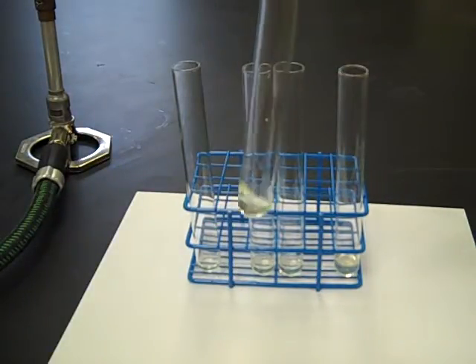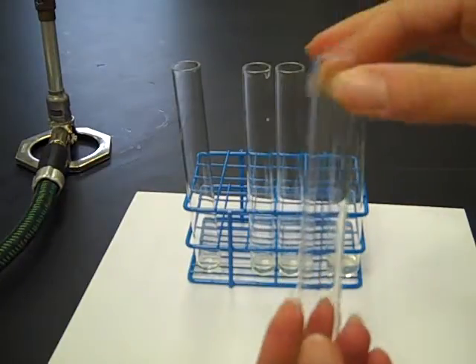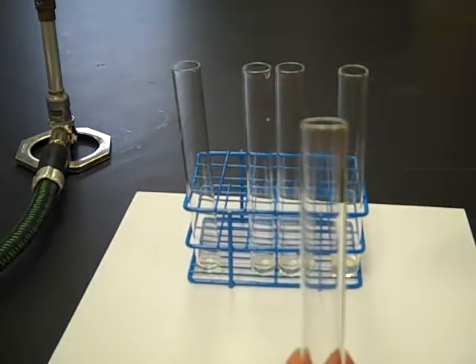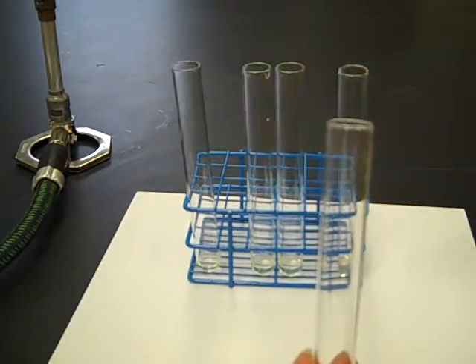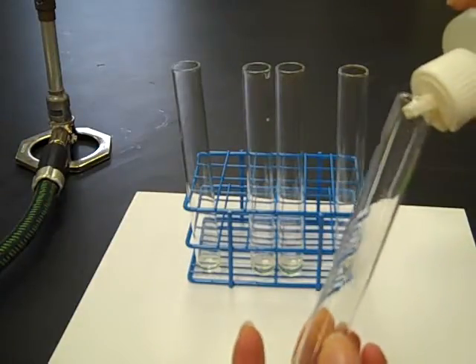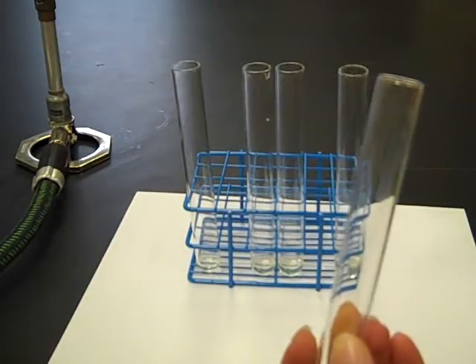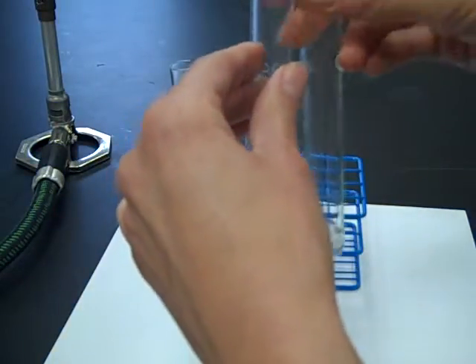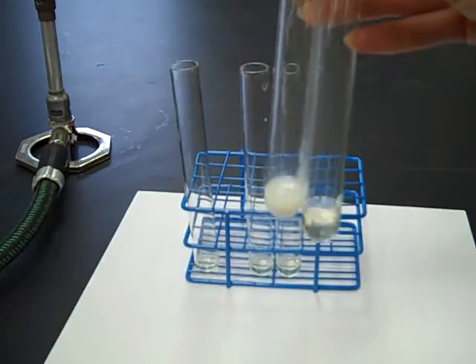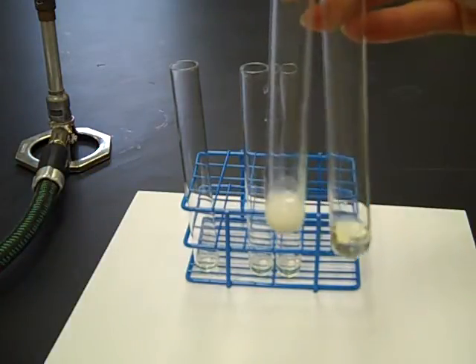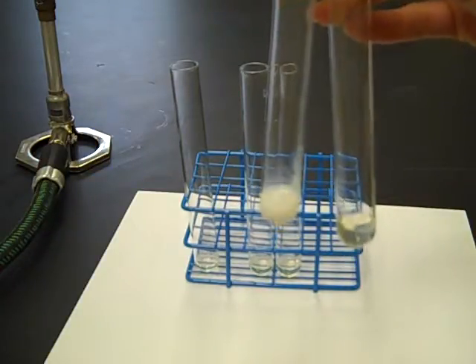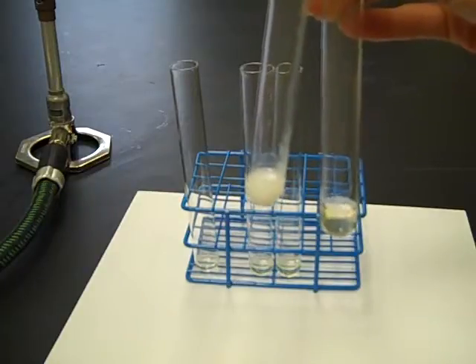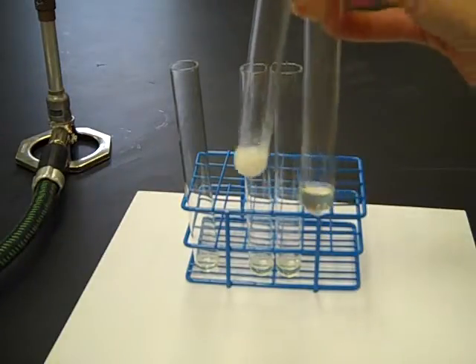To this test tube, we're going to add nitric acid. Okay, comparing to the control, the test tube with nitric acid looks milky, like there is precipitate formed.